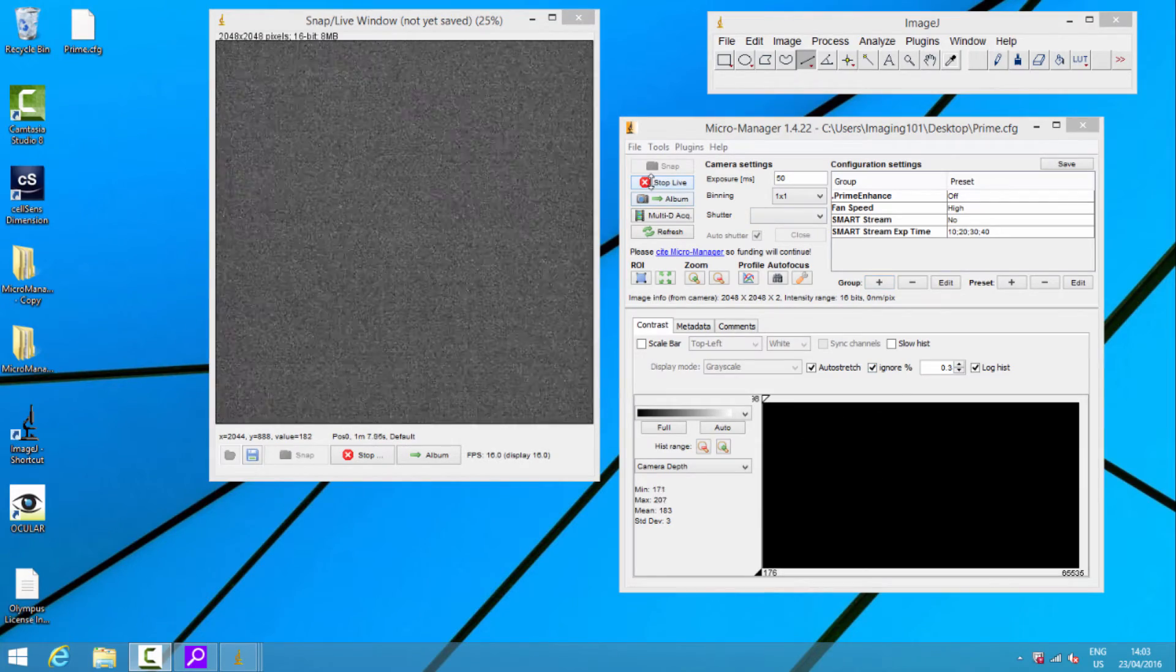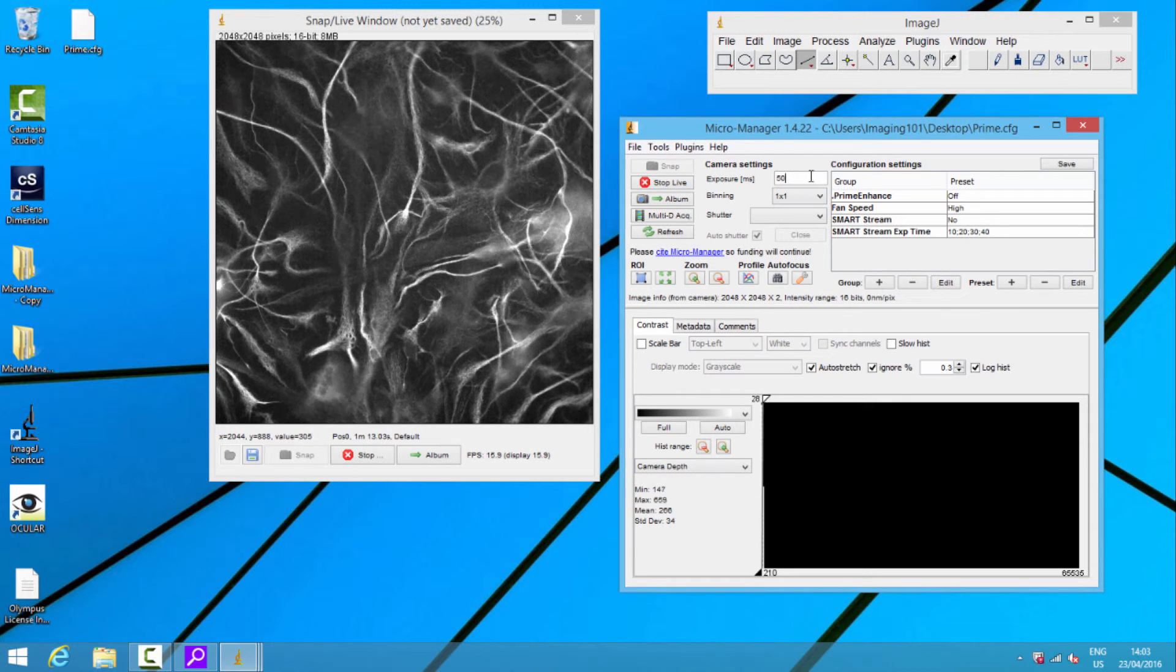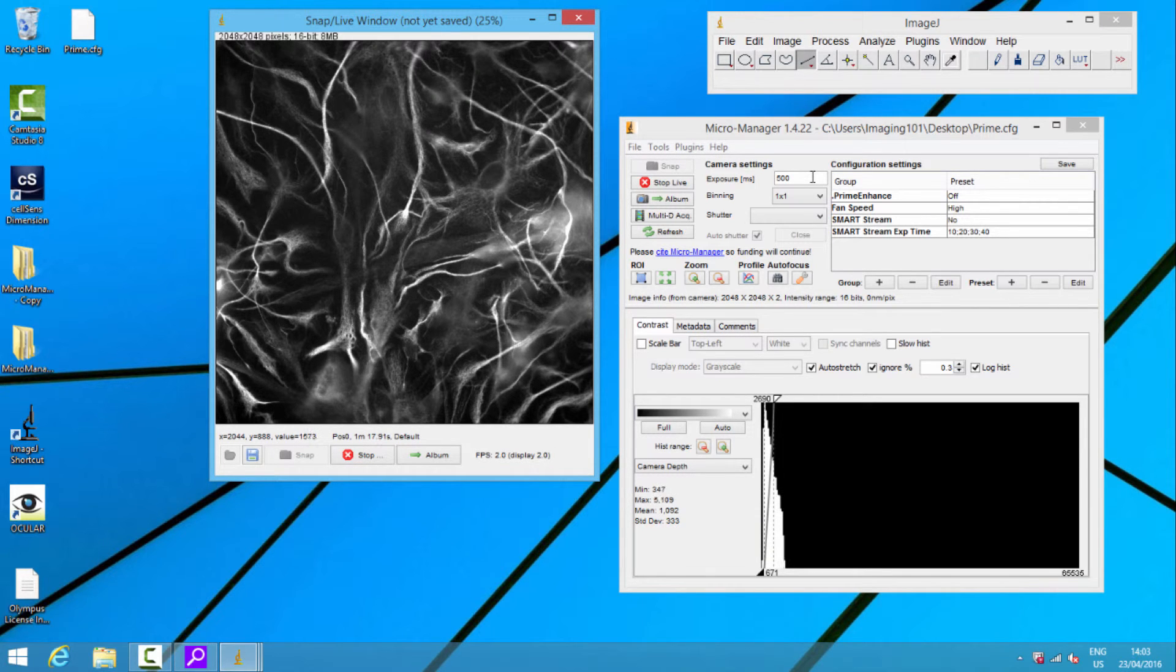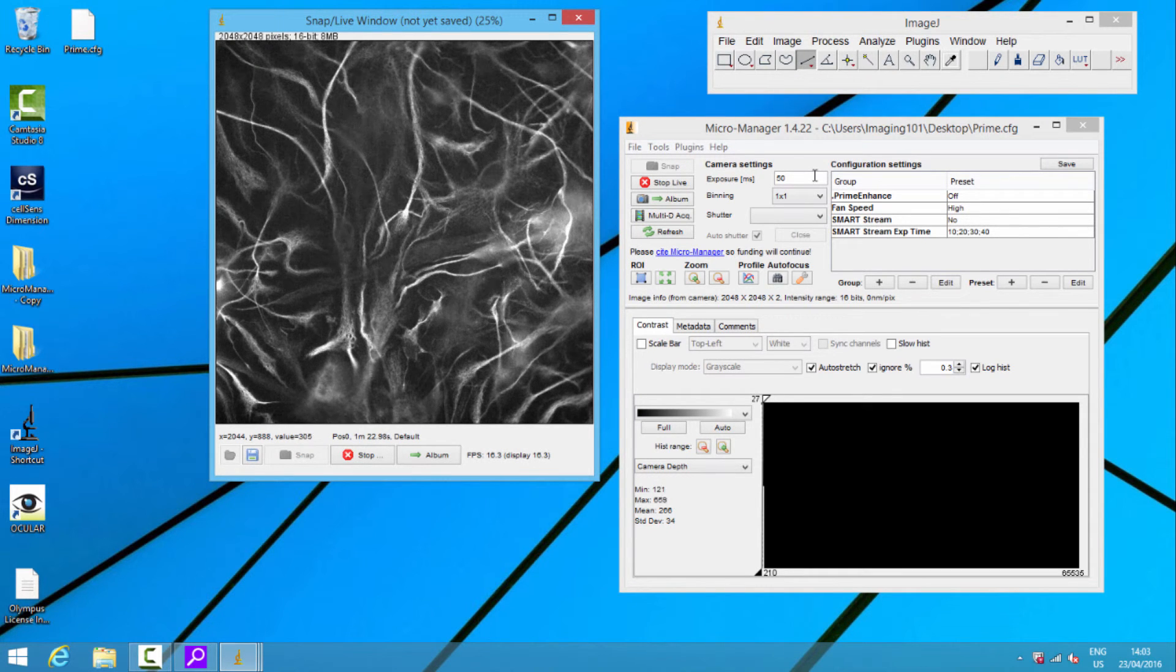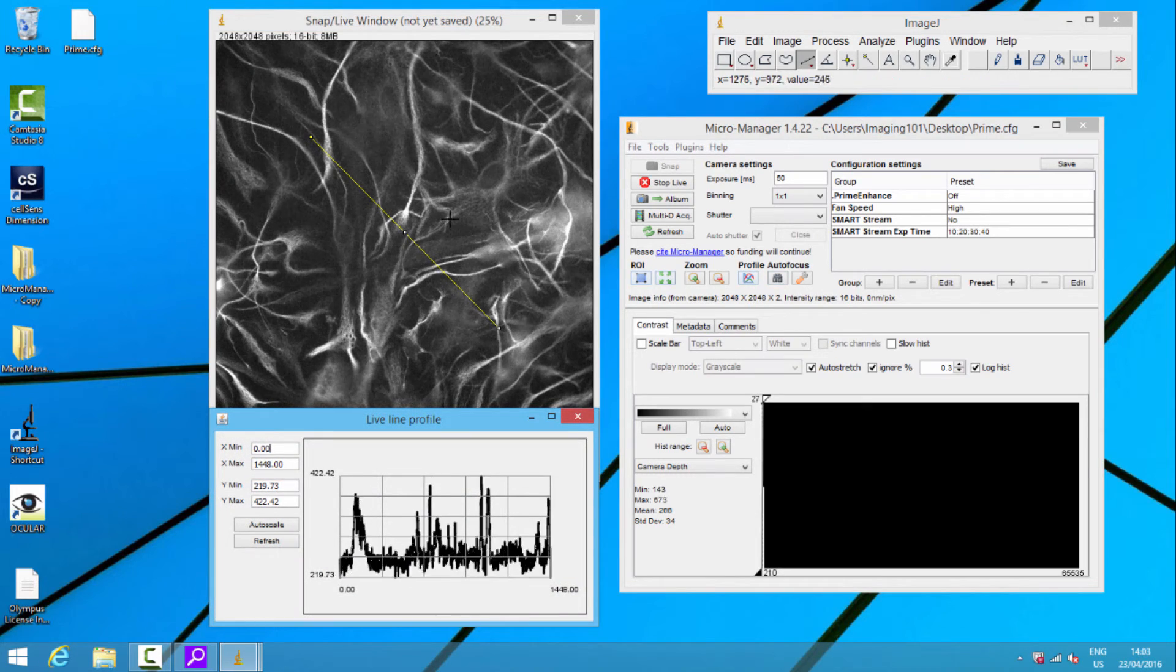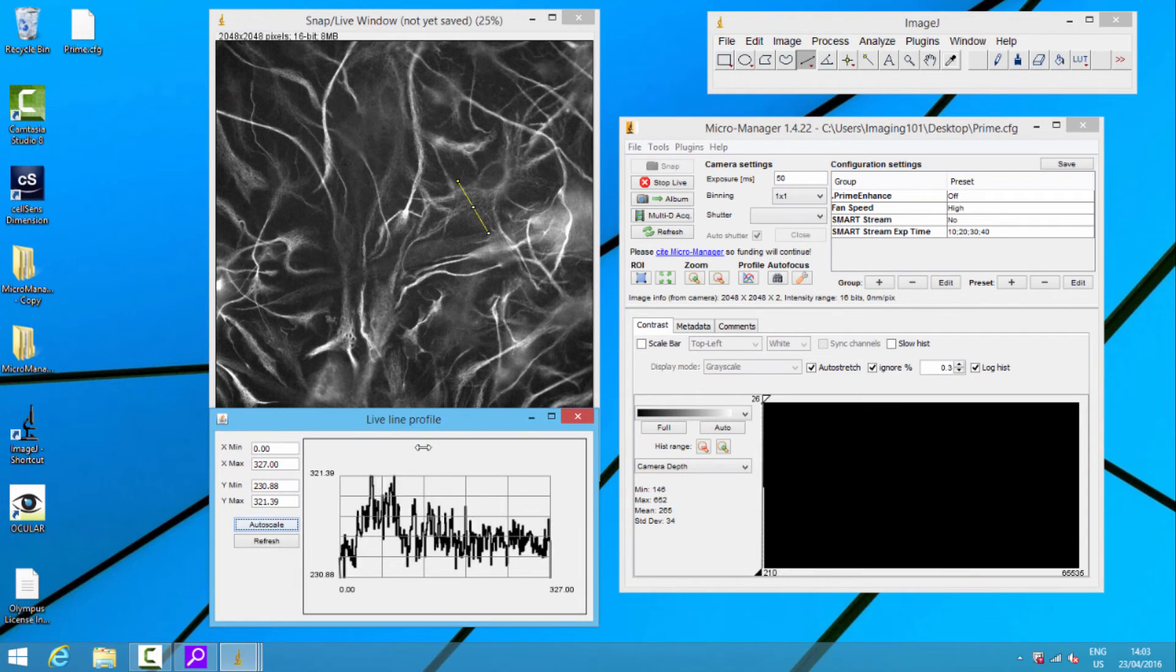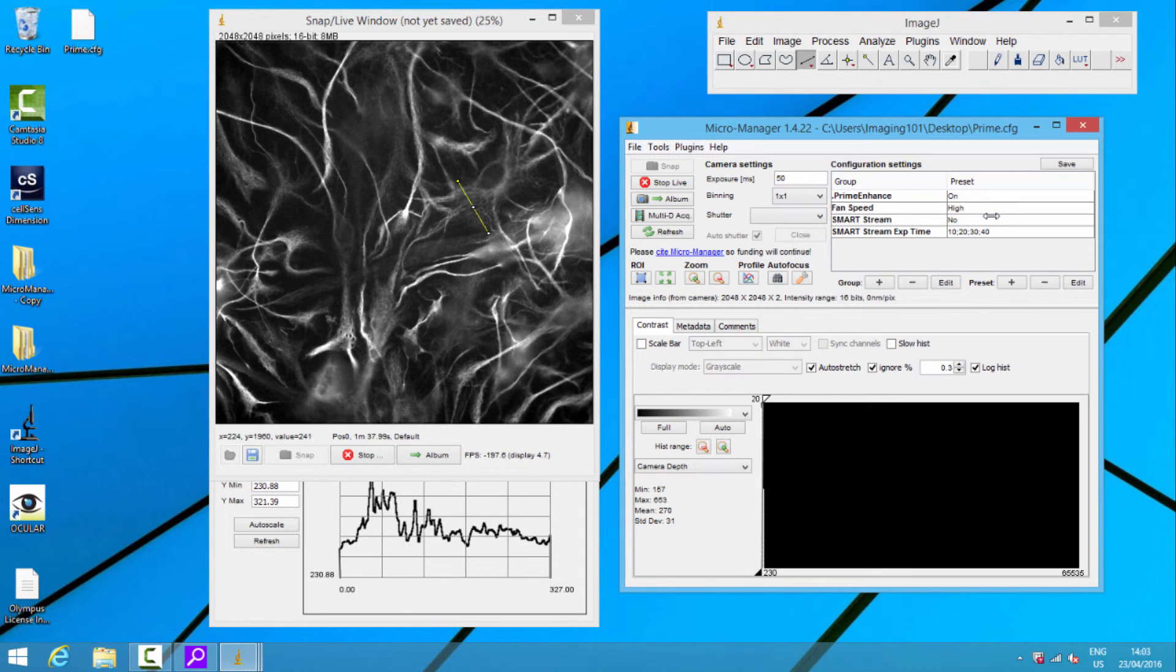So now we're inside Micromanager. Let's just put some light on the sample. There we are. 50 milliseconds we've got. And you can see that noise bouncing around, right? It's a low signal. If we put it up to 500 milliseconds, we now get an image that we're kind of happy with. But we don't want 500 milliseconds on the sample. Really, in a time-lapse experiment, that'll do a lot of damage. So let's just put a little line profile on. Let me just draw that across that little region there. Now, let's turn on Prime Enhance. Look at that line profile change. Look at the quality of the image change.